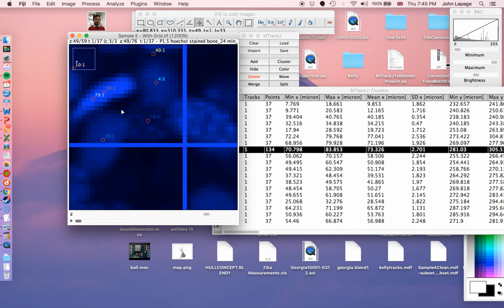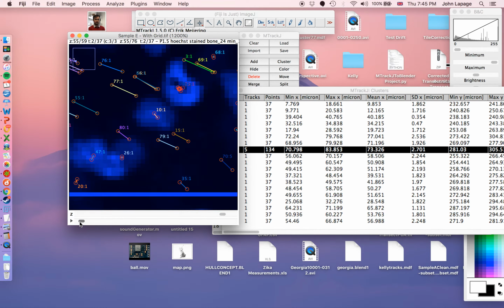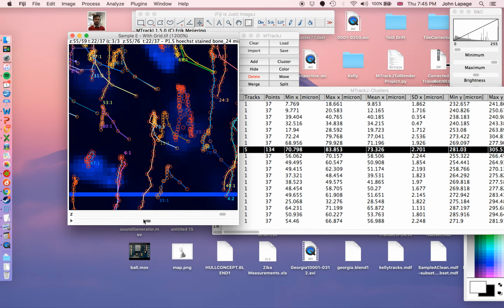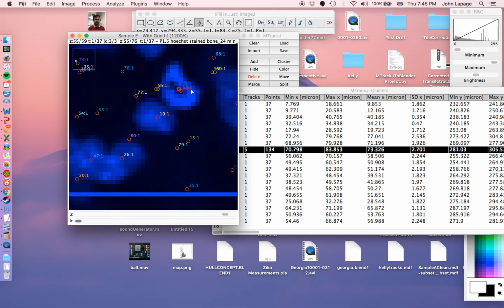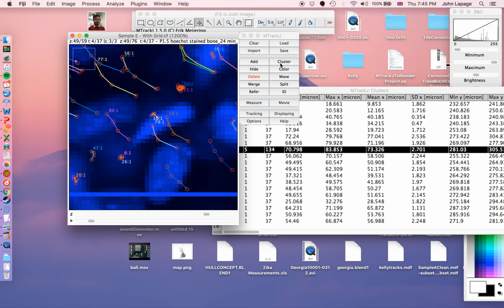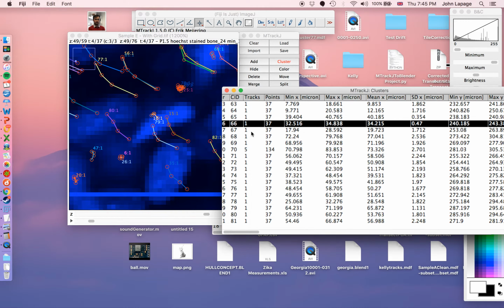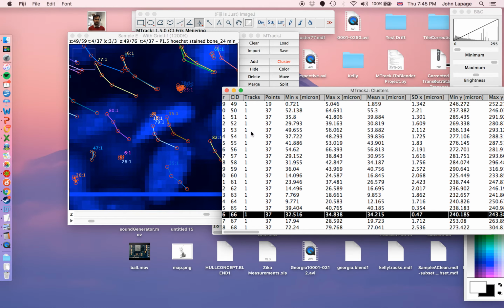Oh no, this one just looks like something where this cell is the curator's decided is dividing, and another cell has just not been clustered correctly. So all we need to do for this one is to put this into a new cluster, and then that's fixed. So that was just a small mistake with clustering.